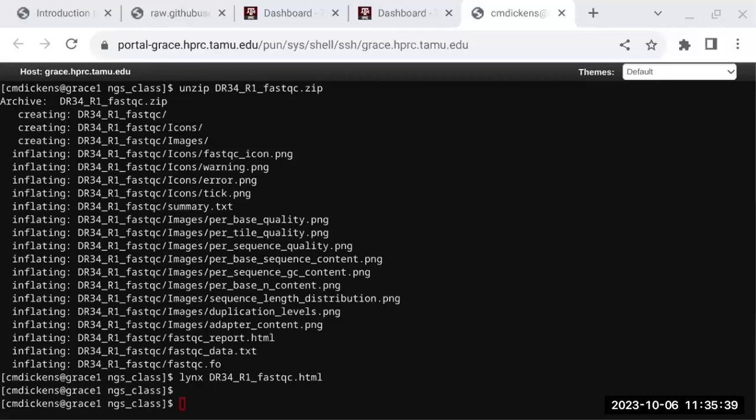So you can merge these two into one longer merged read, and that would go into a singleton file because it's a single read and doesn't have a pair. We've already merged it. This might be useful in some workflows. It might just be an extra step that doesn't provide a lot of utility, but it could be useful. We have tools for that.